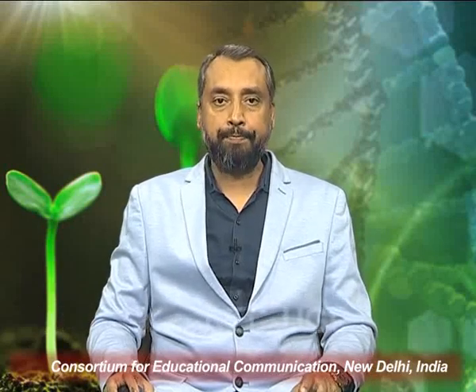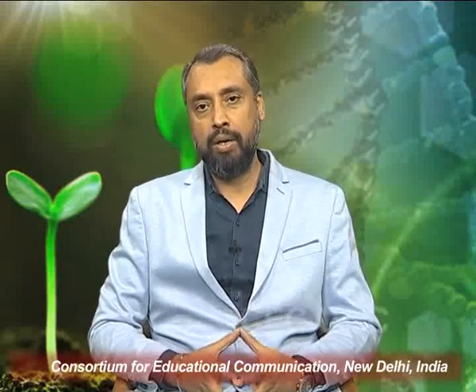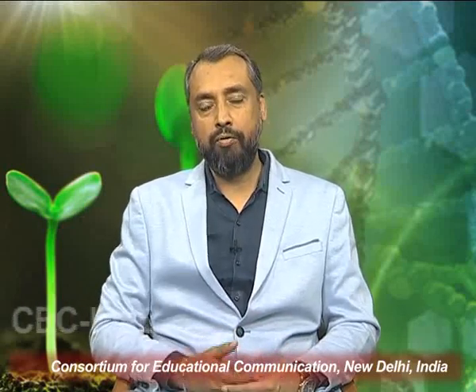So this is a considerable amount of sterilization of the area, and whenever we work on a laminar flow, we intend to switch on this blower at least 30 minutes before we start the work, so that this horizontal flow or the vertical flow of air takes away all the previously occurring microorganisms.